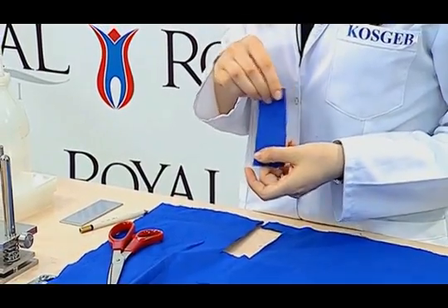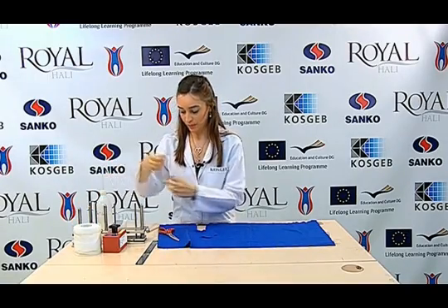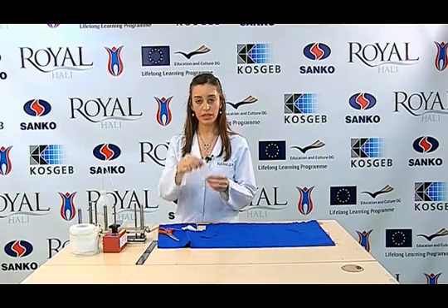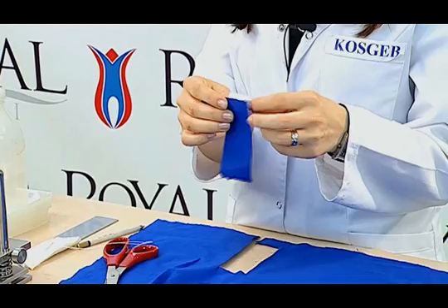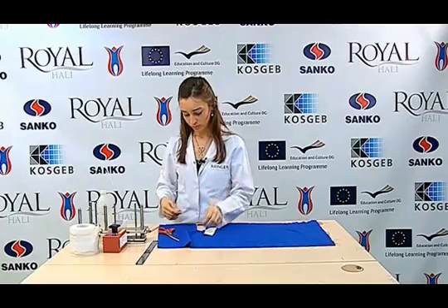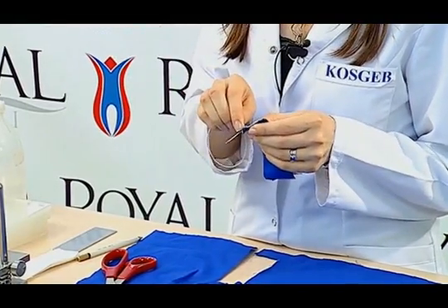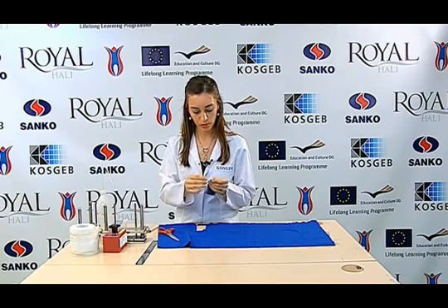I can sew the prepared sample with the adjacent fabric facing each other. As you see, my adjacent fabric is in roll form. I am cutting this in the same width as the sample. I am sewing along the short side in a way that the adjacent fabric and the test sample are facing each other. If the seams are loose, it will be easier to remove the sample from the adjacent fabric at the end of the test.